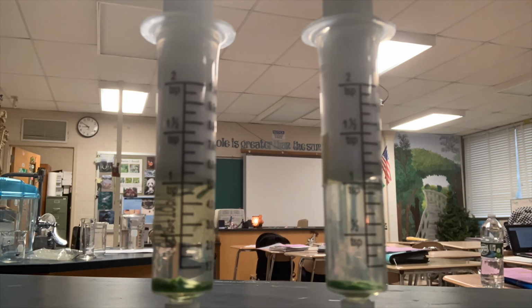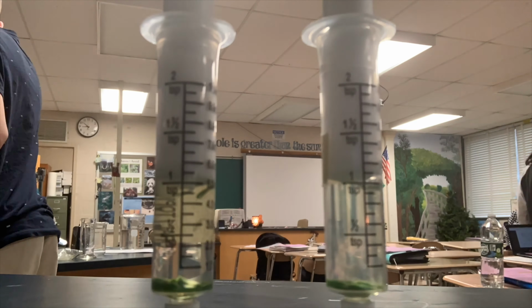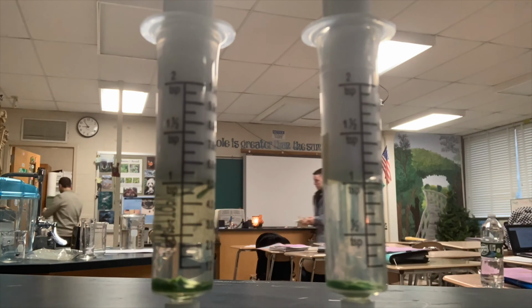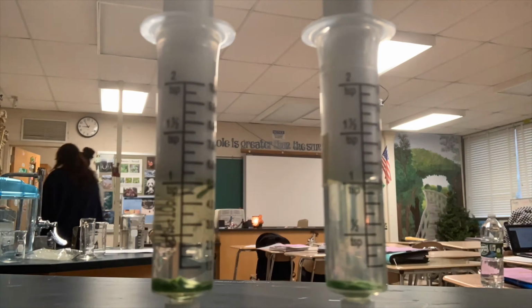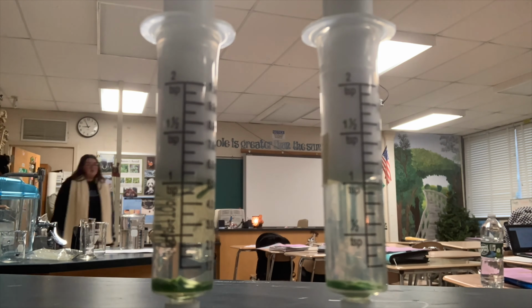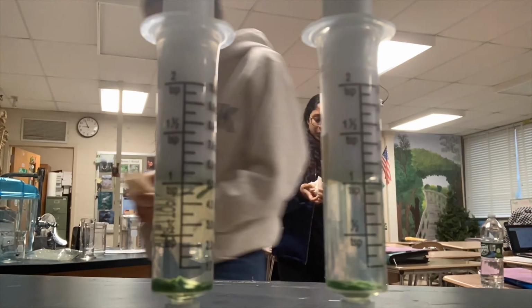What you should observe while performing this experiment is how many leaf discs will start to float. Why does this occur, you may wonder? This is a result of photosynthesis and oxygen being produced as a result of photosynthesis. In other words, the syringes that had the most leaf discs floating had a higher rate of photosynthesis, so more oxygen was being produced.